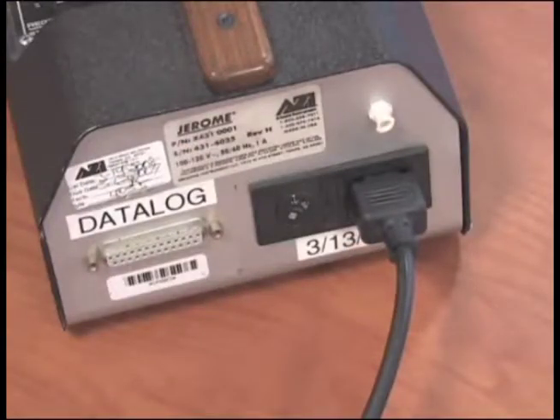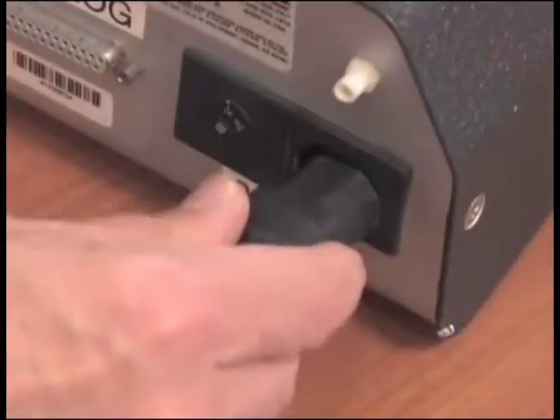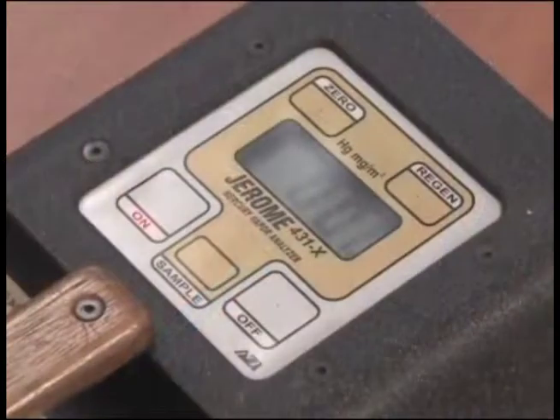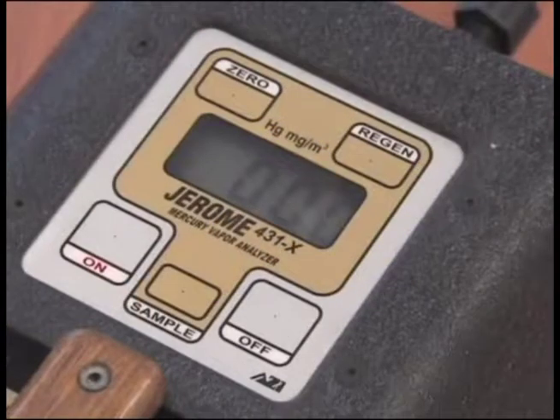You should regenerate the sensor prior to starting your survey. First, push the on button to turn the unit on. Attach the charger cord to the unit and plug it in. Push the regen button. HHH will be flashing on the screen. Regeneration takes approximately 15 minutes. When HHH stops flashing, the sensor has been regenerated. Turn the unit off.